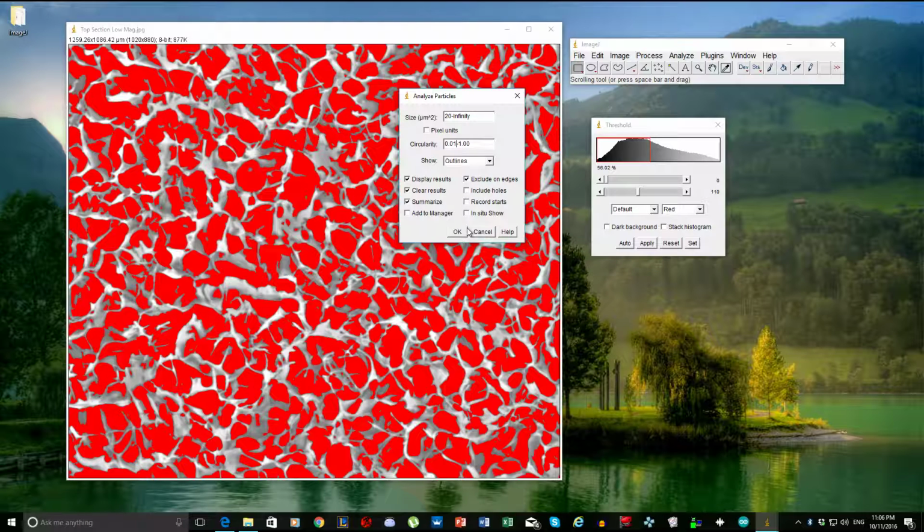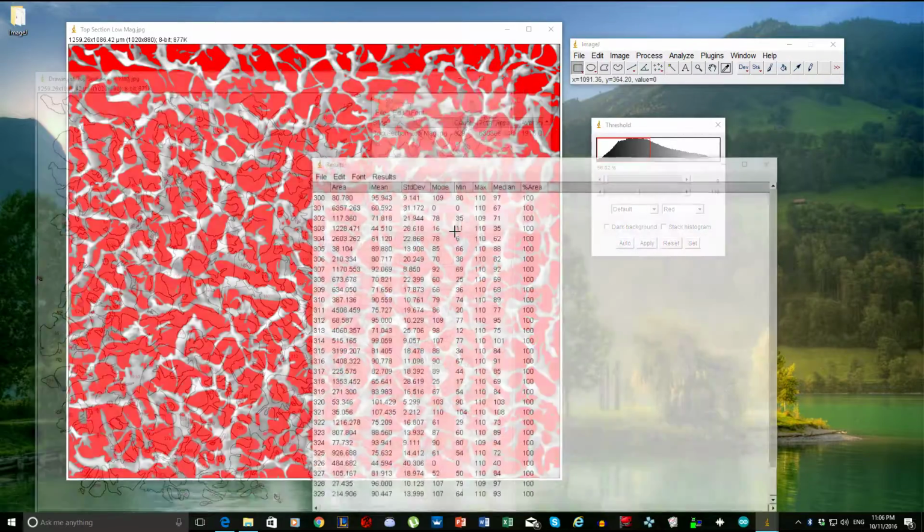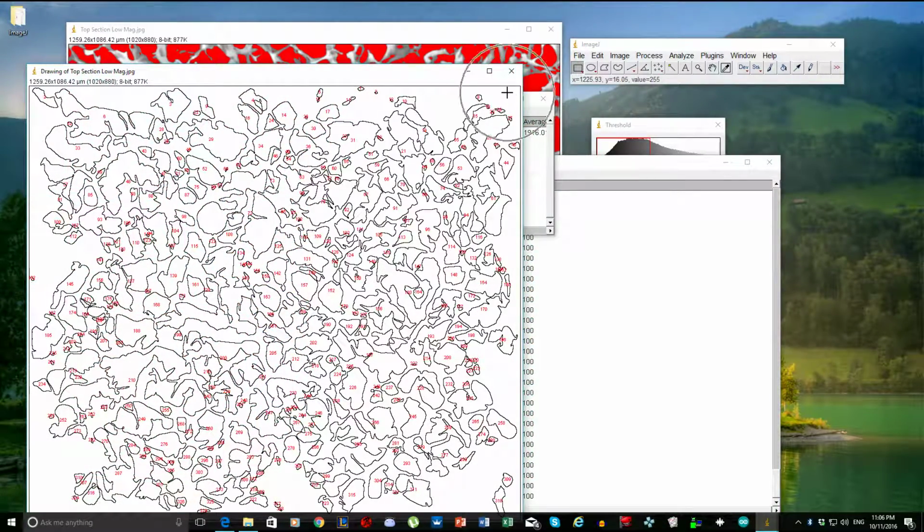You'll see why. Then you hit OK. This you don't change. See, now this went away, this went away, the one that was here went away, this one went away too. I think there was one here. So they got rid of some other noises.